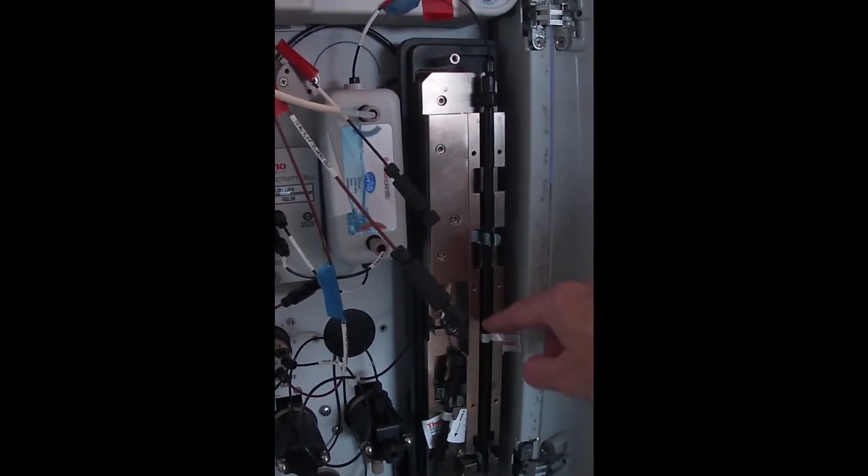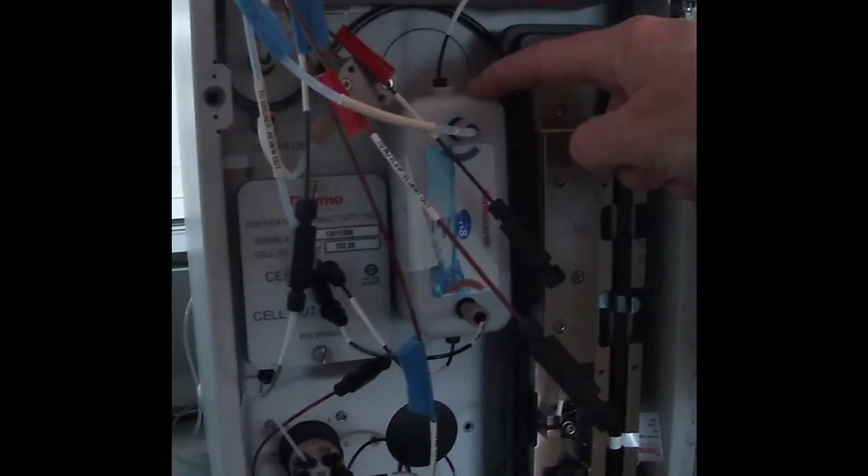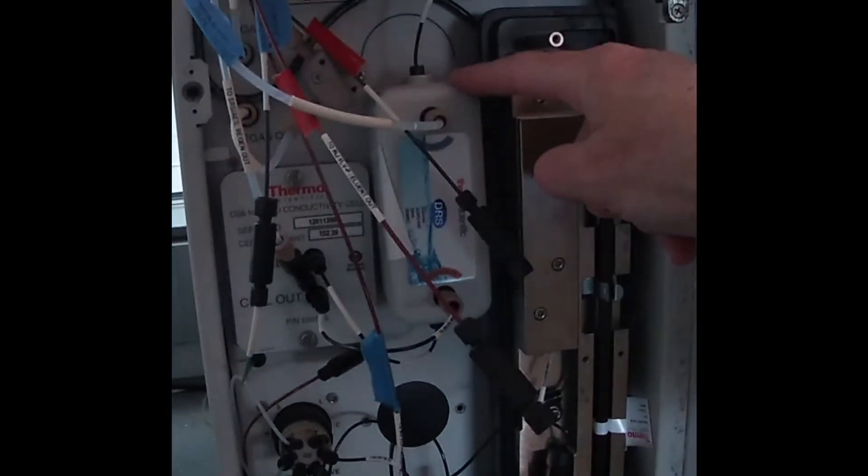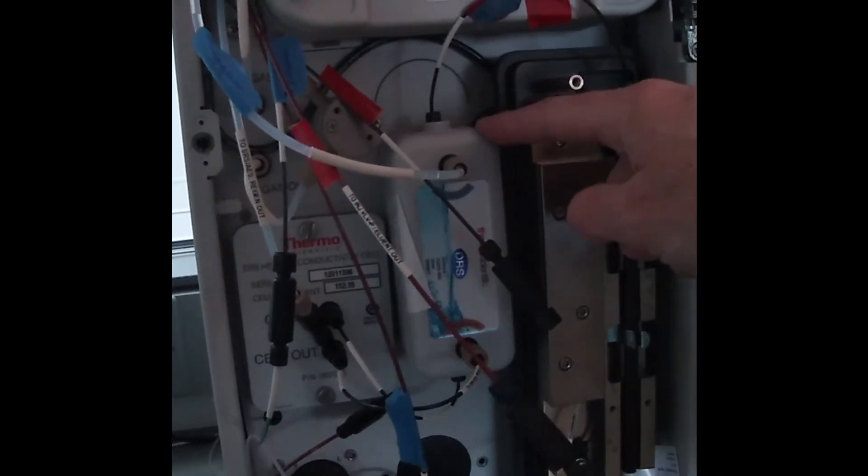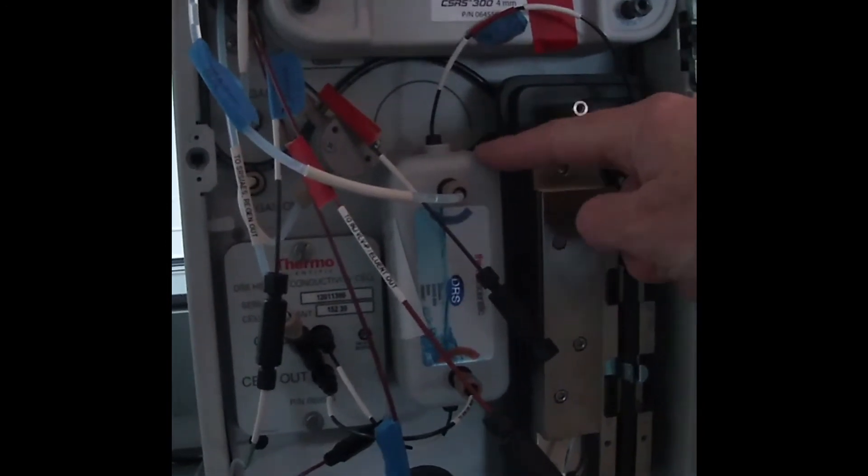So here we do where our anions separate and then they actually come to here. This is our suppressor. When our ions come in here, we actually have a membrane that allows the potassium from the potassium hydroxide to get exchanged with protons.